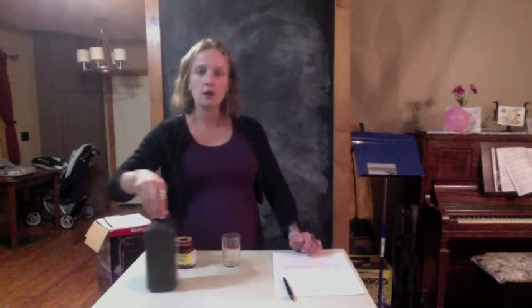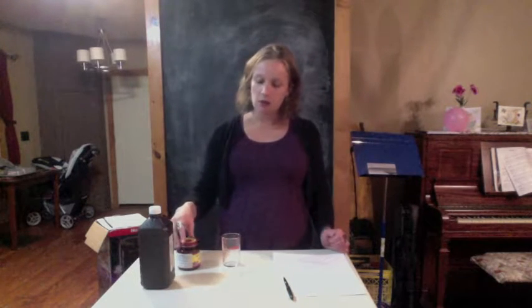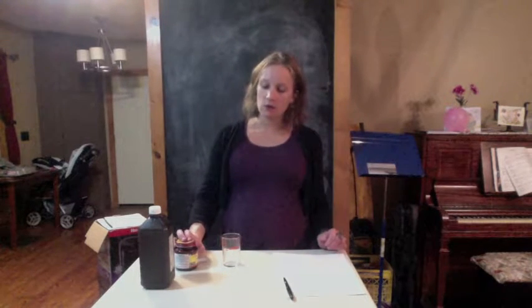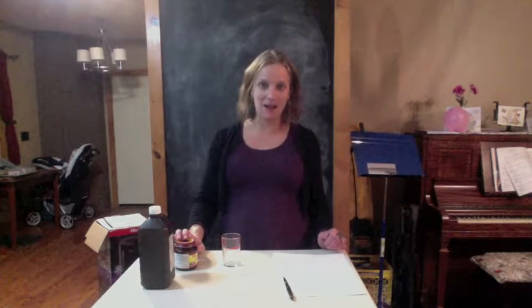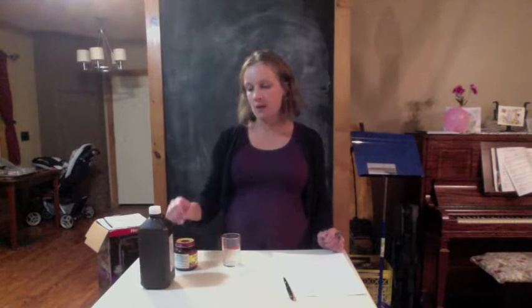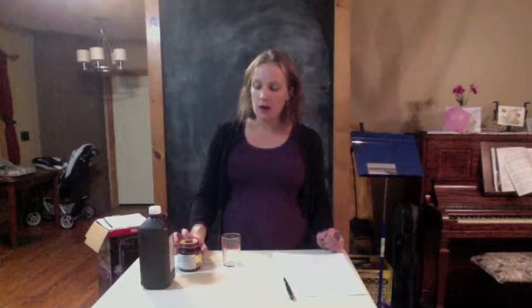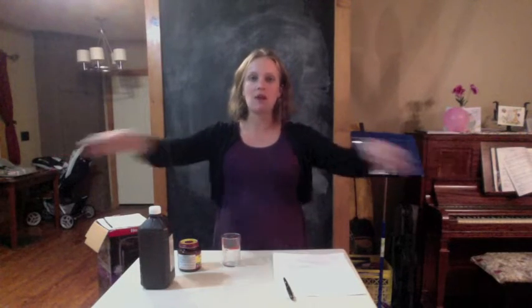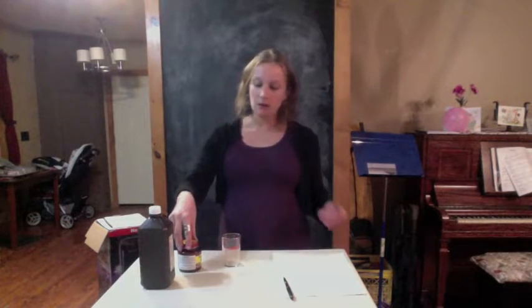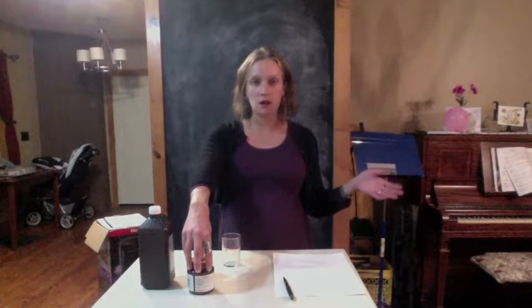Okay, our next question about factors that may affect the rate of a reaction is related to a catalyst. If you don't know what a catalyst is, it's something that's used to actually speed up a reaction. So we're going to be exploring that and observing that in person. A catalyst is not destroyed in the reaction. You can imagine it like someone grabbing two people and bringing them together and then walking away unaffected. The catalyst helps to facilitate a reaction but leaves the reaction unchanged.